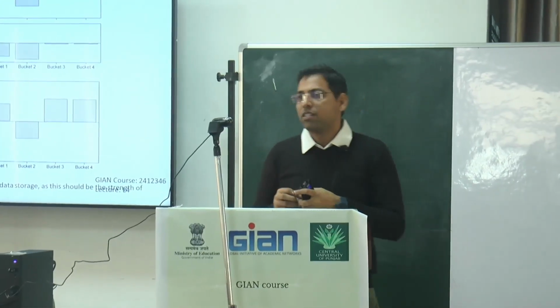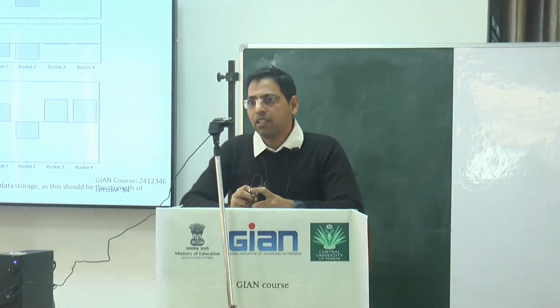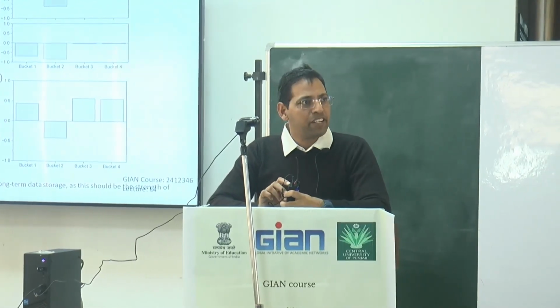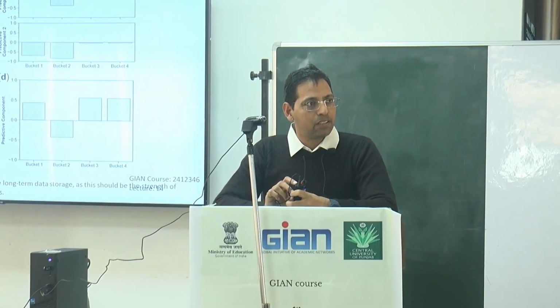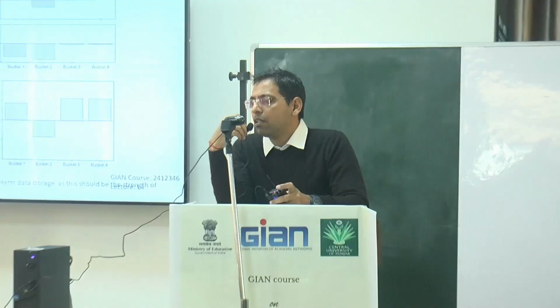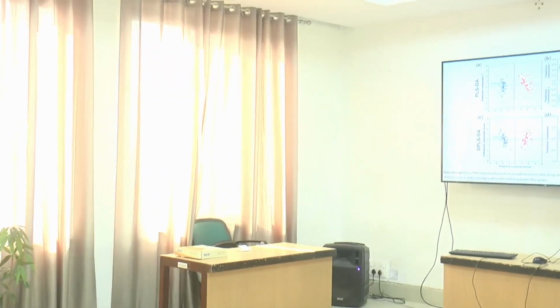So, sir will explain the two things. One is the LCMS, and second is the multivariate analysis. No, these things differ from every case. The first thing is what metabolite we have to analyze.